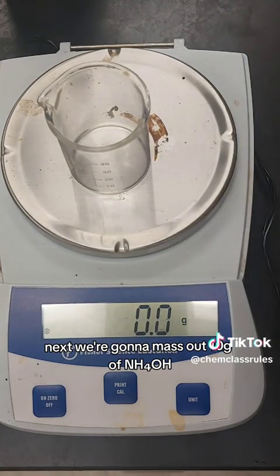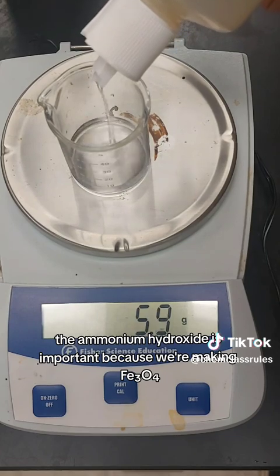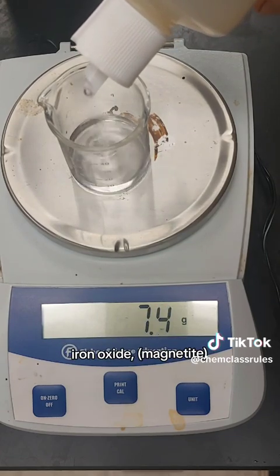Next, we're going to mass out 10 grams of ammonium hydroxide. The ammonium hydroxide is important because we're making Fe3O4 — iron oxide magnetite.